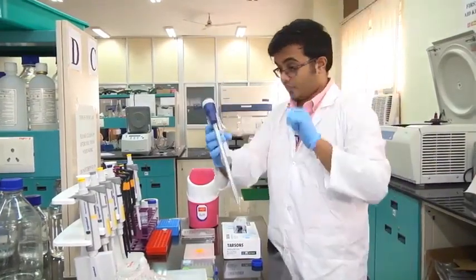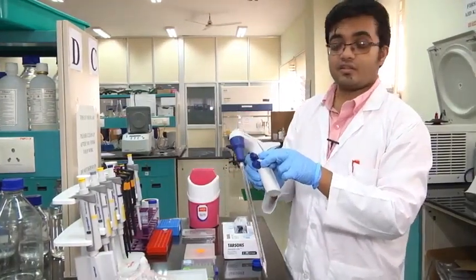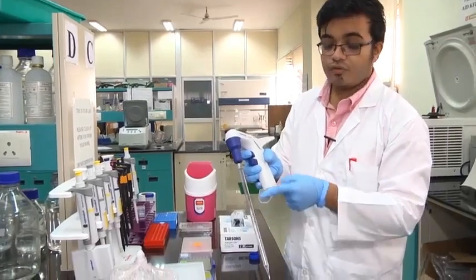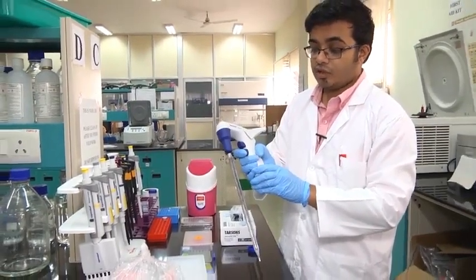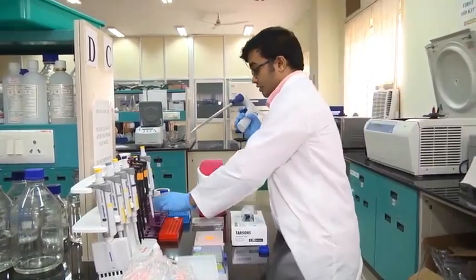So let's do that. The way this operates is, you will notice that this has two buttons. The upper button, when you press, it will withdraw fluid. When you stop, it will hold it in that particular volume. And when you press the lower button, it is going to dispense the liquid. Let me demonstrate.